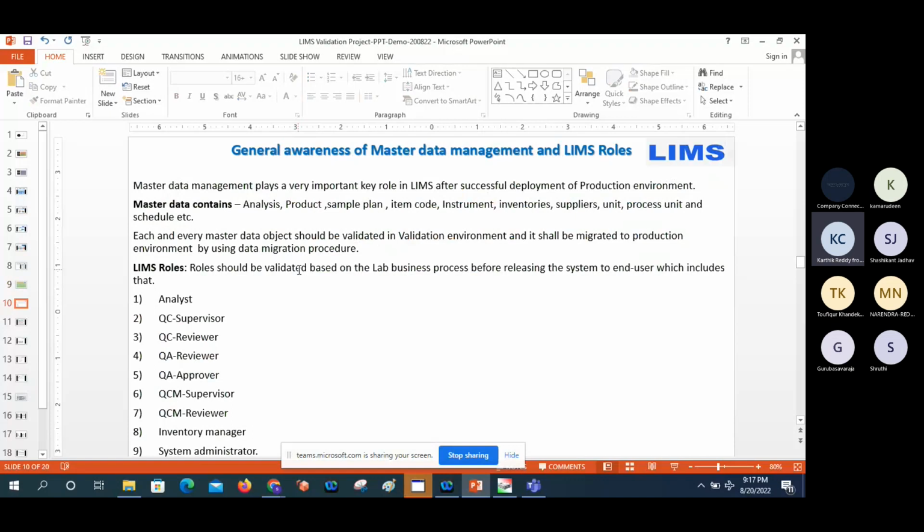In the validation environment, once you move there, you need to test whether the results are properly generated for that particular master data. If not, you can correct it there itself if any typo error is there. Otherwise, we need to do it again in the static environment with the same data, and migrate it to the quality environment by taking some QMS document. So you can do the corrections, and after that again perform some kind of results entry, dummy results entry, or whatever approved specification results in the LIMS system. Then you can get the reports like COA, certificate of analysis, and some test summary reports.